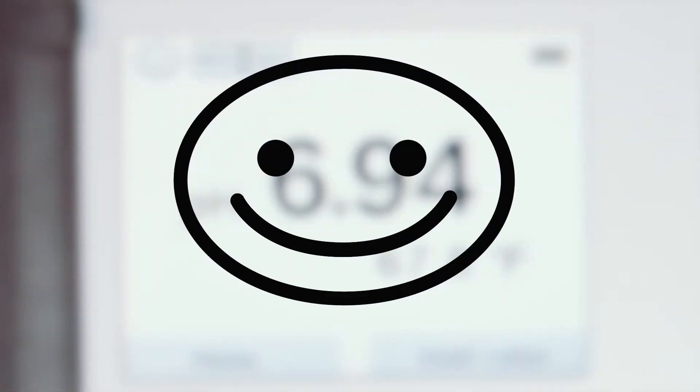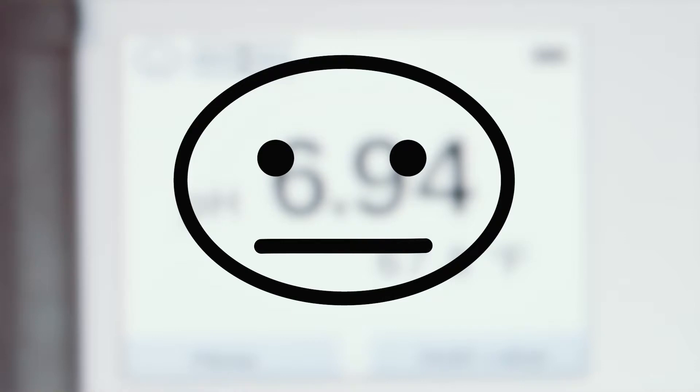A smiley face indicates that all is okay. A neutral face gives an indication that the sensor should be cleaned and calibrated soon. And lastly, a sad face indicates that the sensor should be visually inspected and cleaned and calibrated, or quite possibly the sensor needs replaced.